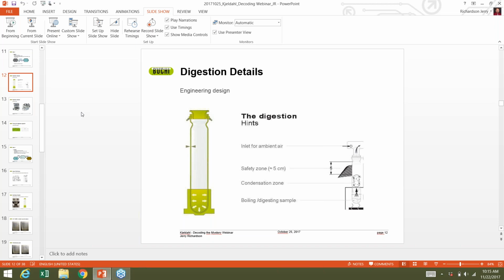All right, is there any benefit to 25% sodium hydroxide for fatty food samples? We currently use the standard methods for all our sample matrices. Should there be different methods for high fat, high salt, and food samples, etc.? Basically, when I talk about optimization, the one thing I try to do with people is we have one, maybe two methods at the most, if you have a consistent type of sample type. To me, the primary thing is simplicity.